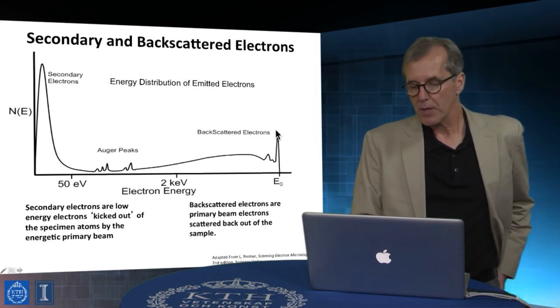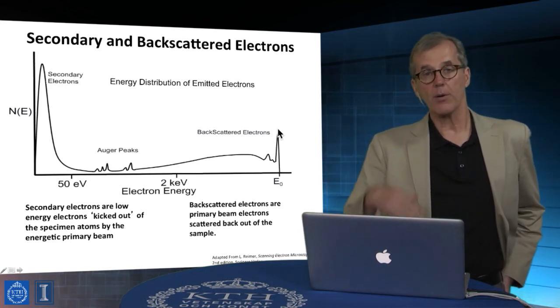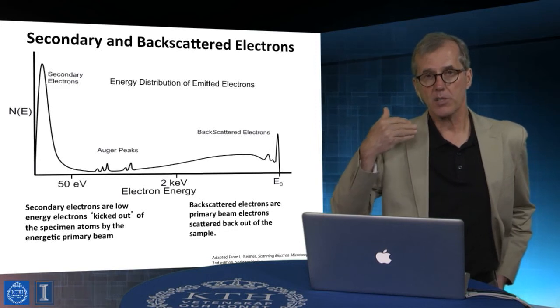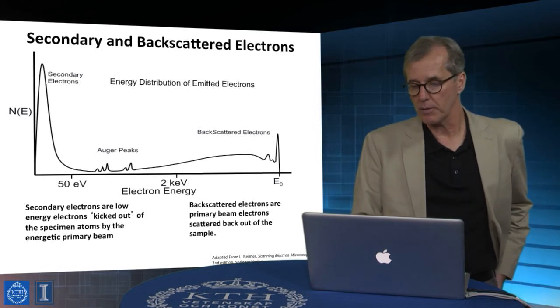But then electrons will come out showing characteristic elastic scattering, where the electrons have lost no energy. The energy that comes out is the energy that was put in.